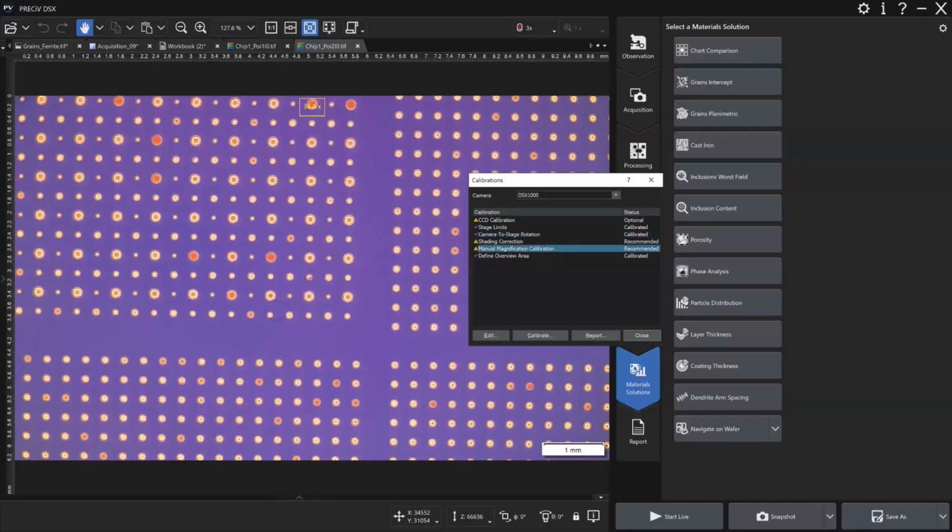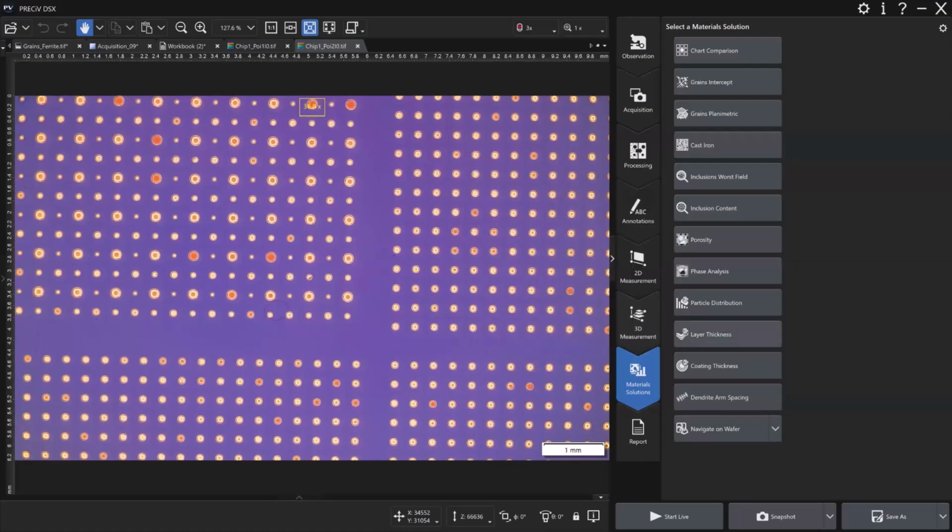If they purchase the standard that works with the software from us, there's a calibration standard with known distances, and it can do auto calibration. Auto calibration would work for every zoom setting and every mag objective. It would go through and it looks at the pattern of lines that it knows that distance of the pattern. So it measures them across the entire field of view.